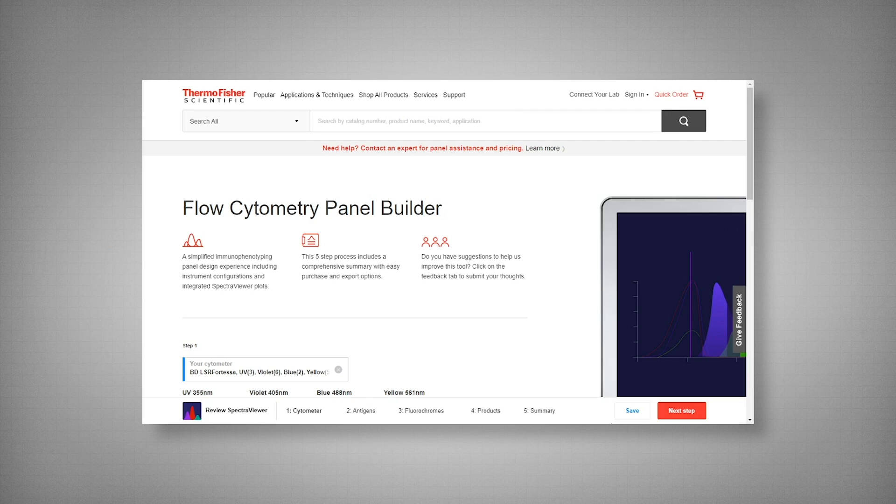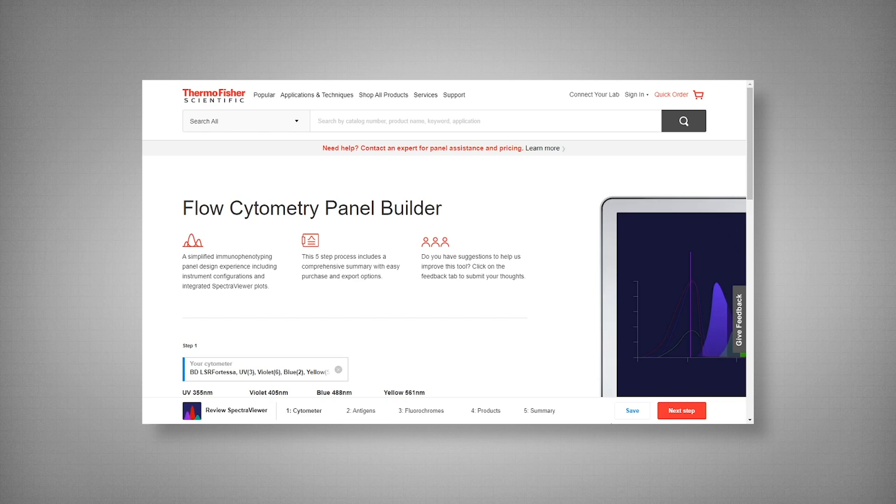Hi, my name is Natalie and I am an R&D scientist with Thermo Fisher Scientific. I will present a macrophage panel designed with the Invitrogen Flow Cytometry Panel Builder.